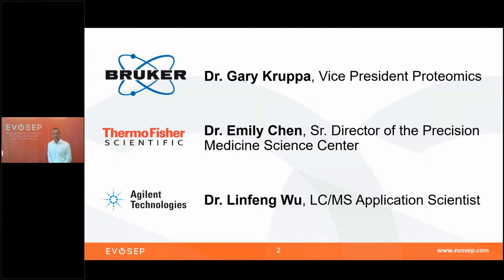Just to give an introduction to Gary, we very early on, when we developed the Evosep One technology, realized that this timsTOF, and especially the PASEF technology, could do really wonders for the short gradients. And especially with the dia-PASEF that Gary just talked about, that was something that got us really excited. And I think with Gary and his team, the application team in Bremen, we managed to really pull off some of these data not so long ago. So really nice work. And once again, thank you very much for the nice presentation, Gary.